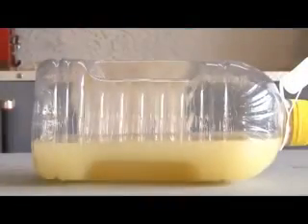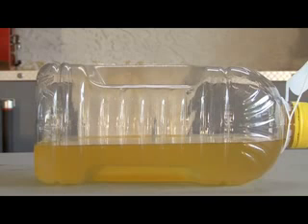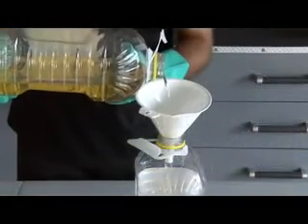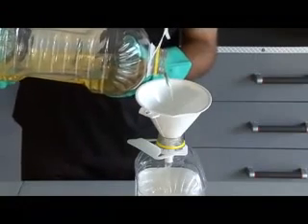Set this mixture aside, and in about a half hour or so you'll see some color change take place, and you should start to see a darker layer at the bottom. This is our glycerin, and our biodiesel is the lighter color on the top. Now you need to let this mixture sit overnight, and the next day you'll see a dramatic change in the color. Now it's time to pour the biodiesel layer off the top into another bottle, and we don't want to pour any of the glycerin in there, just the biodiesel.